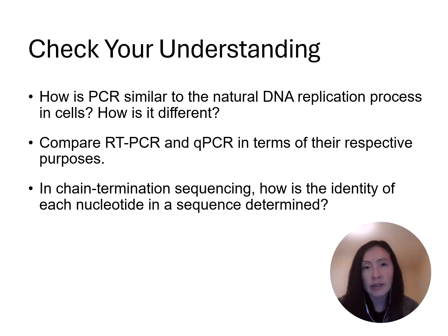In qPCR, that was quantitative or real-time PCR. That measures DNA amplification as it happens. So we're going to be using fluorescence to quantify DNA or sometimes RNA levels. And this would be useful in, for example, detecting viral load.